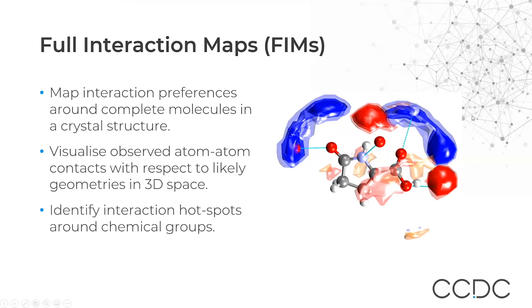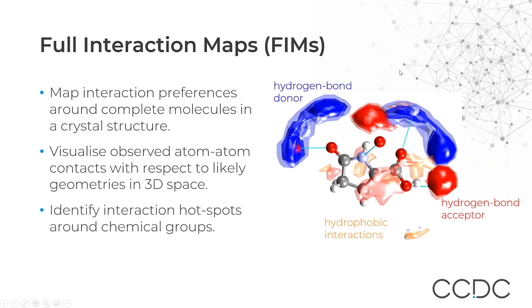We are visualizing a 3D map of where we would expect interactions. In blue are areas where we would expect to find hydrogen bond donors. In red, areas where we would expect to find hydrogen bond acceptors. And in orange, areas where we would expect to find hydrophobic interactions, such as aromatic or CH groups.